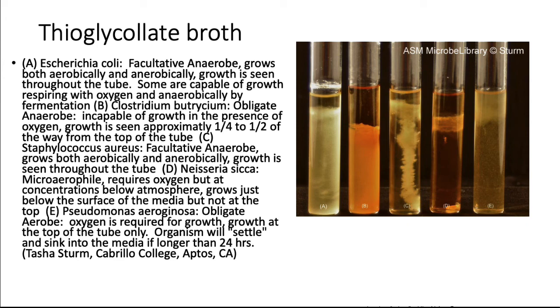And in the case of C, well, the growth pattern is a little bit funky, but again, this is not something that you're going to get in an exam. A picture like that, you will get a diagram, but it is growing everywhere, but a little bit more towards the top. And there is no aerotolerant in this particular picture.